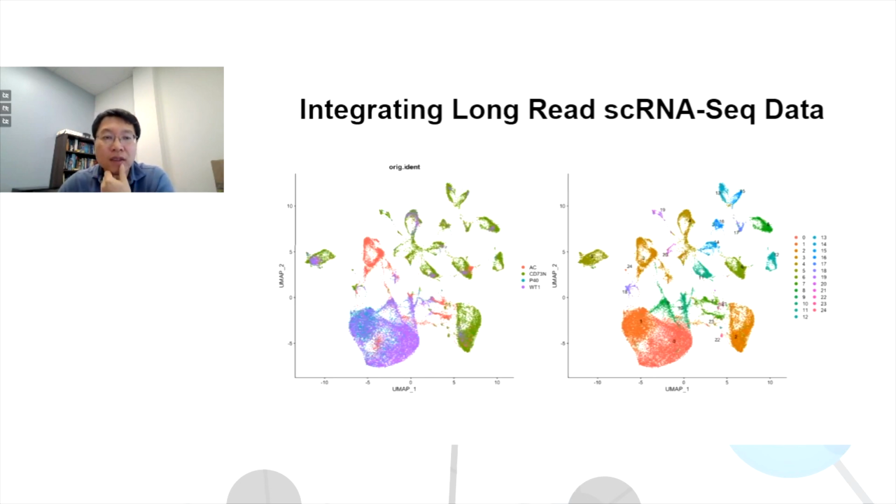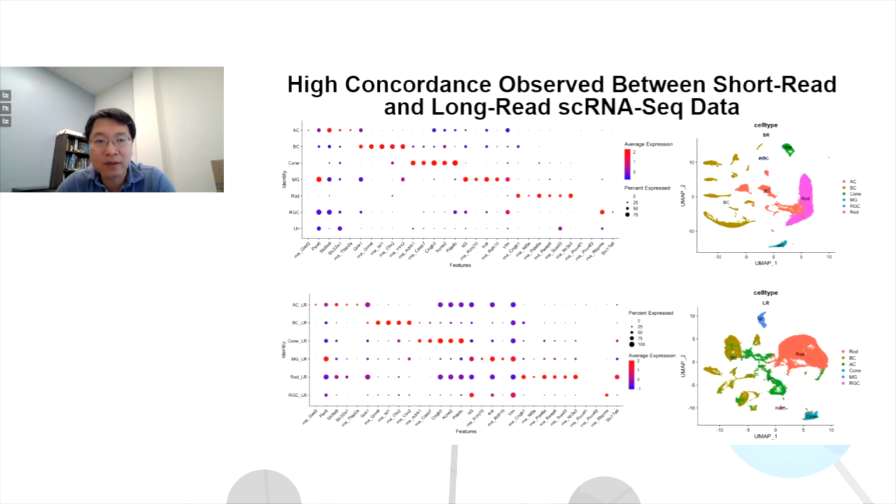Similarly, looking at the long read data set, you also see the green clusters are coming from the bipolar cells, and the red ones are amacrine cells. The 2 wild type samples go together nicely, and those are different cell types. So again, this also performs as we expected.